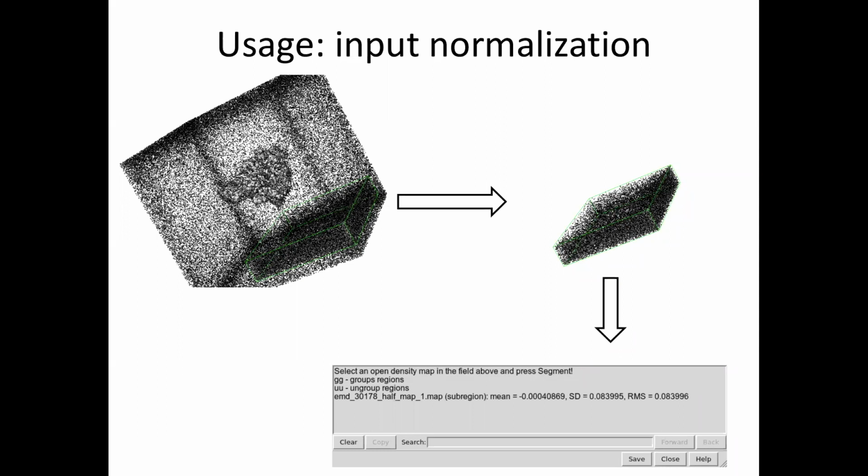But yeah, there might be some pathological cases in which this does not work well. We are not aware of any, but I can imagine that you have very nasty things that give you a very bad normalization at the beginning. It won't work. Yeah, well, I don't have a tremendous amount of experience with cryo-EM, but I could envision something like, okay, there's a pixel that's overloaded, and again, that's an analogy from X-ray work, or there's a uranium particle or a gold particle that we were using for registration. Yeah, well, now we have an outlier and our mean is off. But if you're calculating the density manually, you just avoid that region. That's true. So. Thank you.